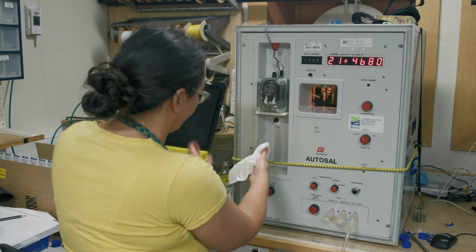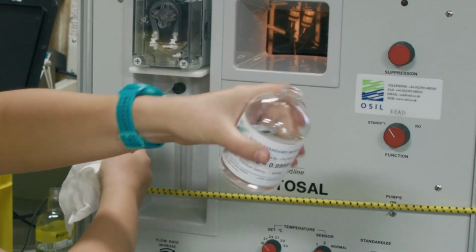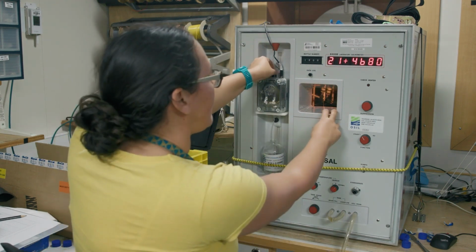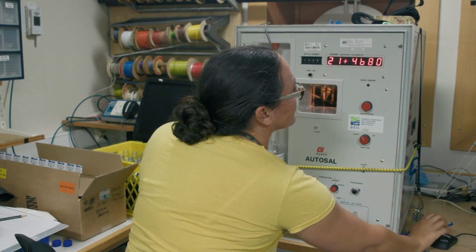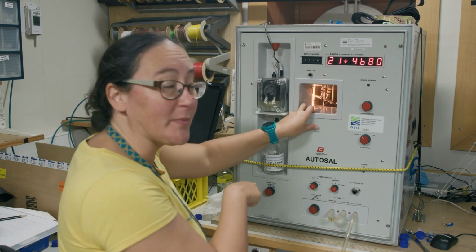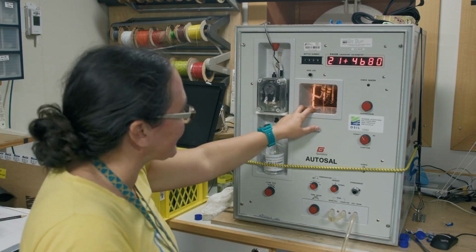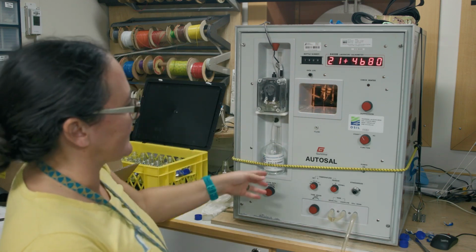So first we take an old or previously opened bottle of standard seawater and use that to flush through several times. Turn on the peristaltic pump, cover the flush valve to allow water to drain from the cell, uncover it to refill the cell from the bottle, and repeat several times. The conductivity of this old bottle doesn't need to be recorded since we know that it will probably have gotten saltier through being unsealed, but you can check the reading to make sure it's around what you expect. For this model, that will be 1.999 something.